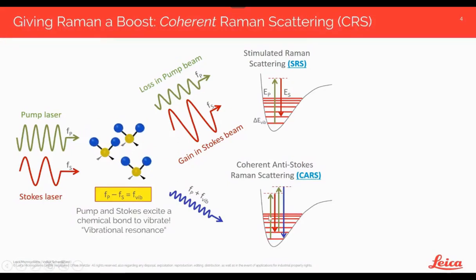So what's happening here, the first two steps are exactly identical to the ones in stimulated Raman scattering. However, then the molecules can absorb yet another pump photon to a second virtual state, from which then the blue shifted anti-Stokes photon is emitted. So this is again called the CARS process. And both of these processes are combined under the umbrella term coherent Raman scattering.